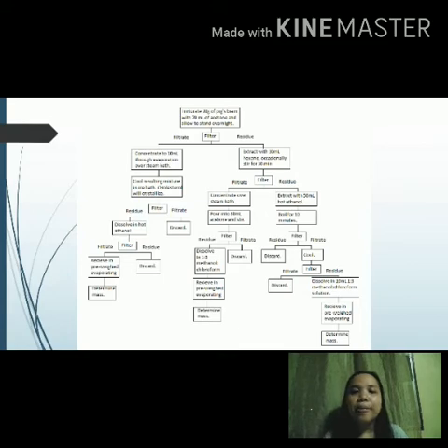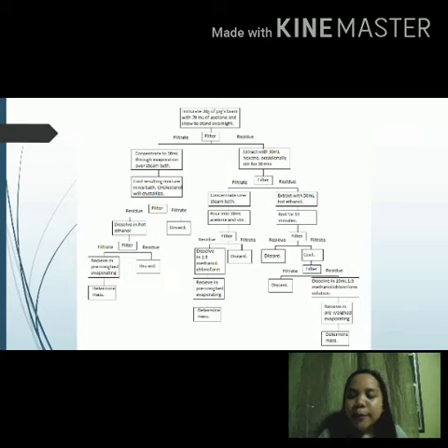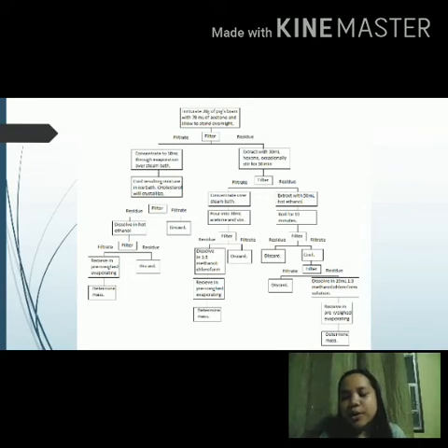So after the isolation of cholesterol follows the isolation of phospholipids. The residue from before was used in this procedure. So the residue was extracted with 30 ml hexane.